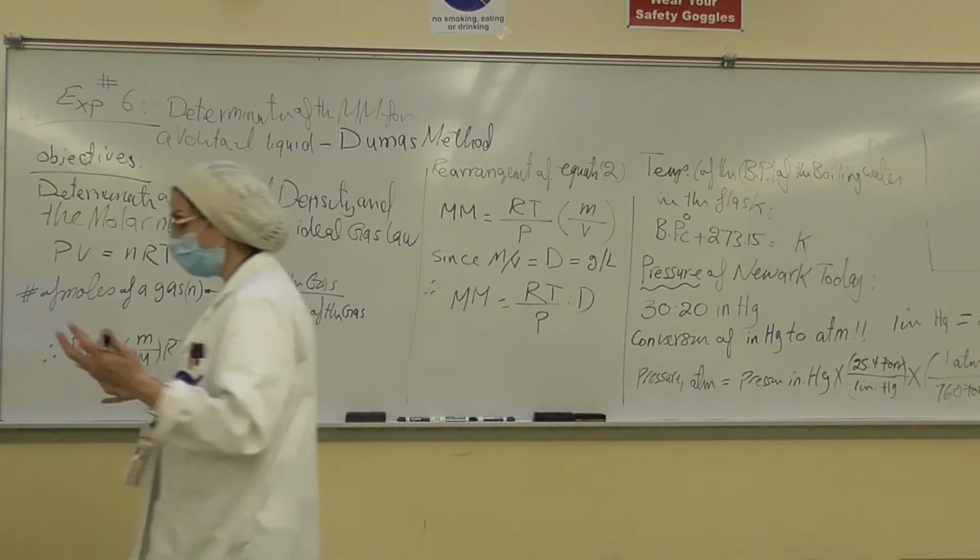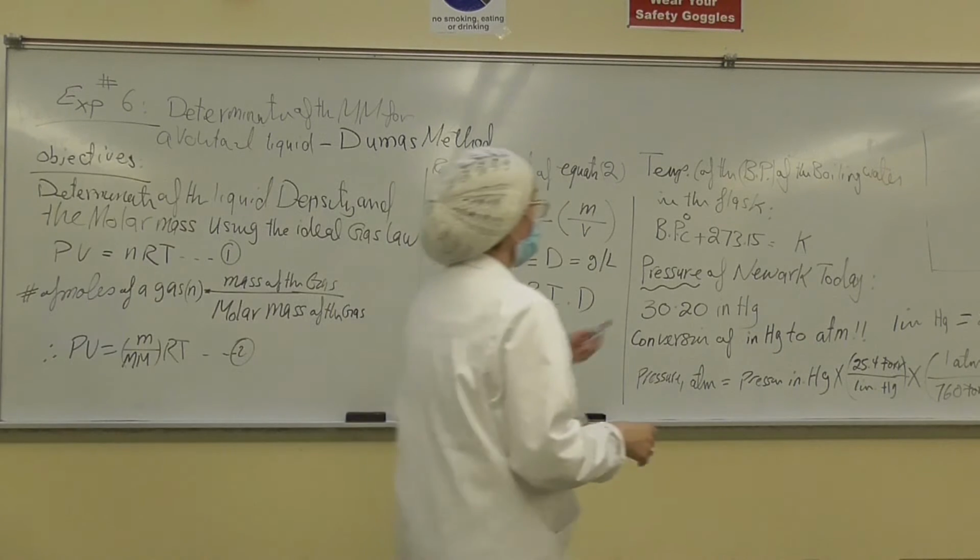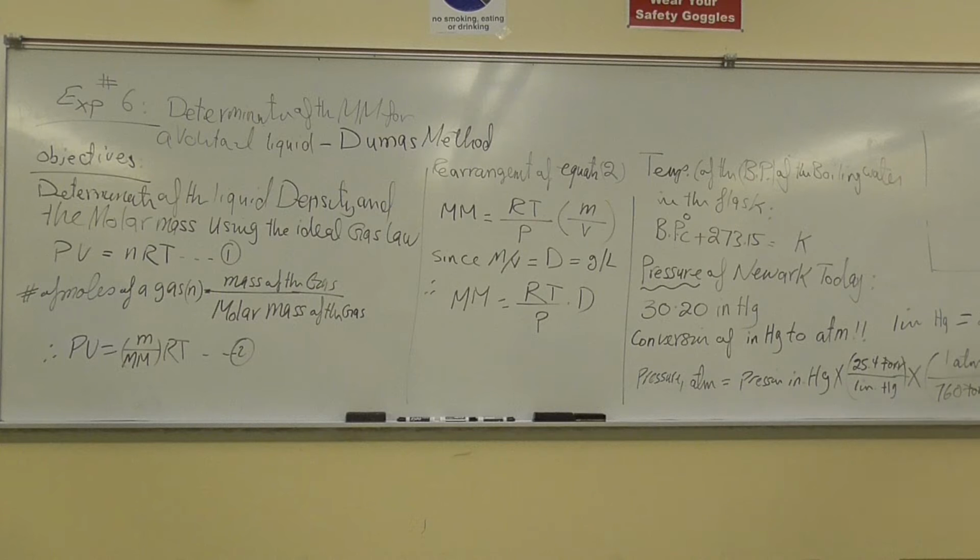I also tried, I don't know if you can see that, over there is the apparatus. So you see the rail is there, and I'm going to get you the hot plate. You need the hot plate also. You're going to have a beaker, right? You are going to fill it to the half with water, tap water.